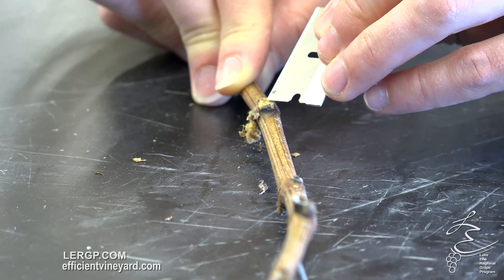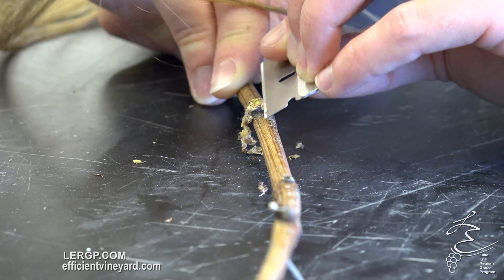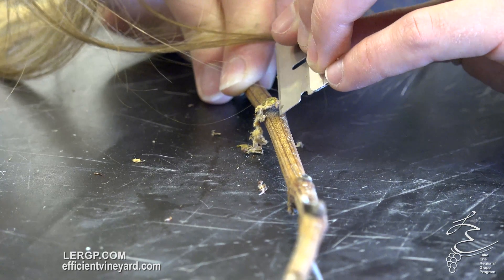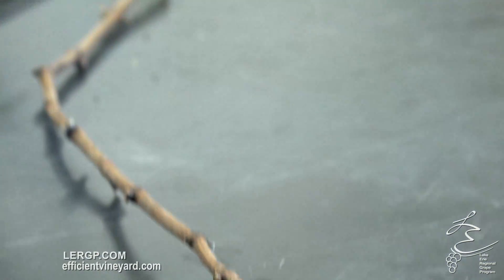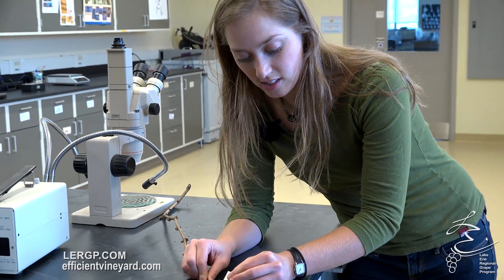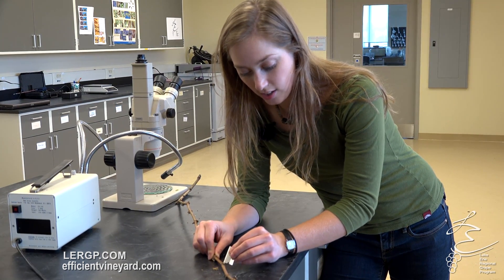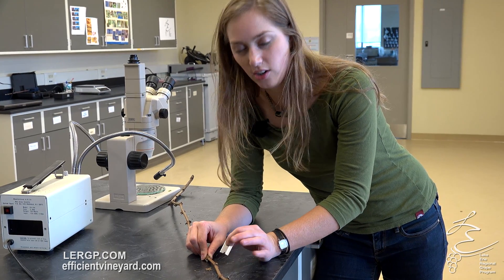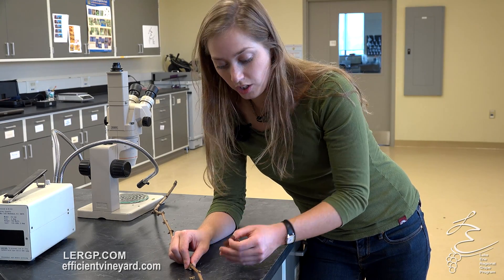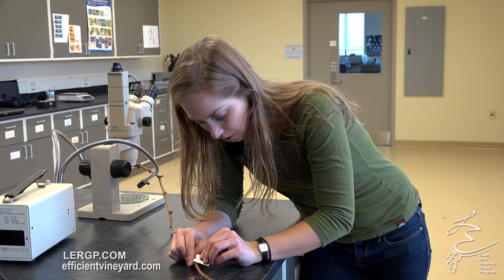The primary bud here is nice and green, the secondary bud is nice and green, and I'm just going to keep slicing away till I can get the tertiary. They all look very happy on this bud. A primary bud is going to have a full crop on it. If the primary bud is dead and the secondary bud is still alive, anecdotally it's about a third crop potential on the secondary bud. And if both the primary and secondary are dead but you still have a tertiary, the tertiary is not going to produce a crop, but it can still be really crucial in keeping the plant alive because it puts out leaf area and creates photosynthesis.